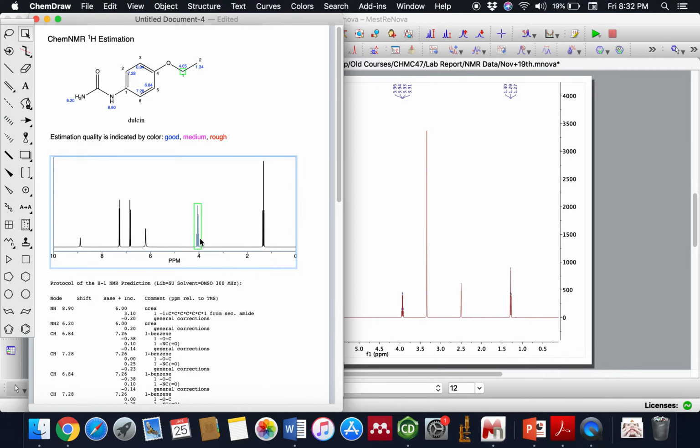For this guy here, it's coming from those two hydrogens, right? So it's a CH2. So I would say that the integration for this peak here is 2, and so on. So it's important to understand what integration means. It's basically the number of protons that are experiencing that chemical shift. So usually you have to pick a peak in your spectrum every time that you are almost sure of how many protons it's coming from.